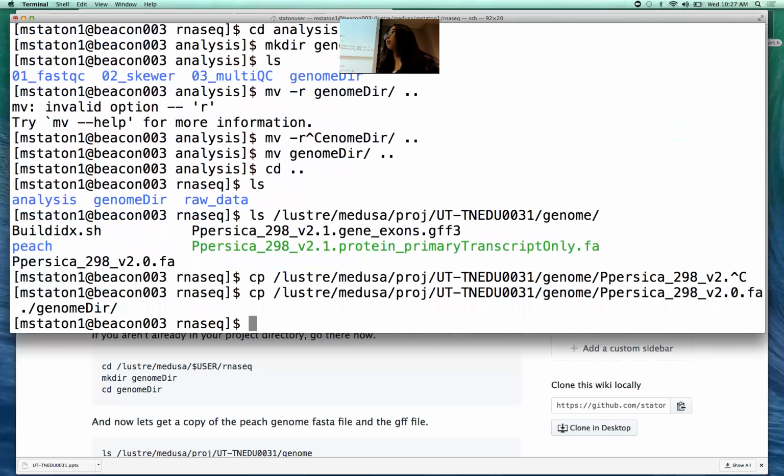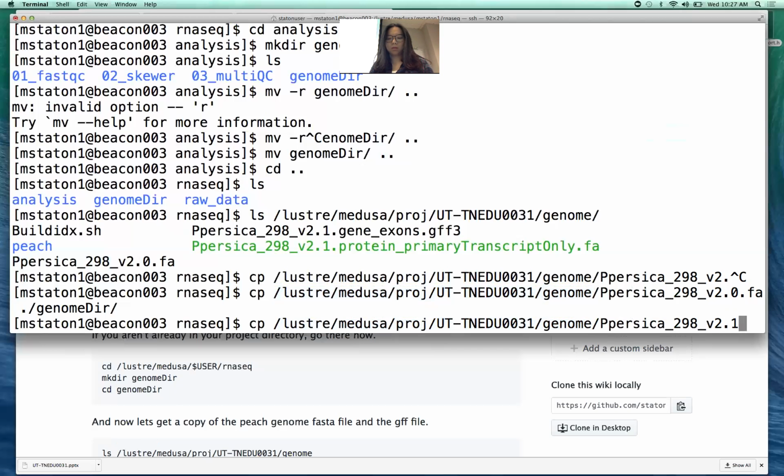If you are having problems where you're typing on the command line and trying to edit, but it doesn't appear to be doing anything, type the command resize and hit enter. That should help. We've been having this problem with the terminals doing weird things. It's only if you're hitting backspace and nothing's happening: press Control-C, then type resize and hit enter. Then your command line should work better.